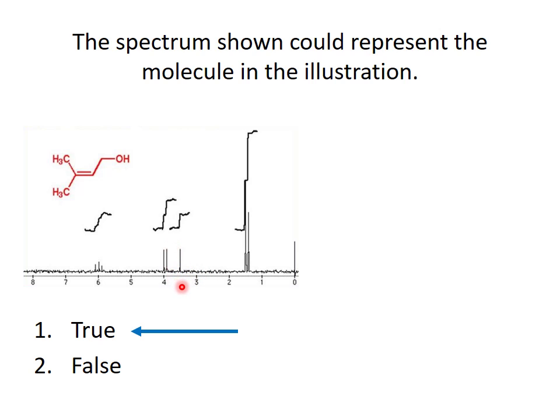Because this is such a noisy, faint spectrum, you can't really see how broad that peak is. And that sometimes does happen with hydroxyl groups. So they're not always amazingly broad like we saw with the ethanol spectrum. But you can test by shaking this with deuterium oxide, and what would you find? You would find that peak would disappear. So this can be that compound.